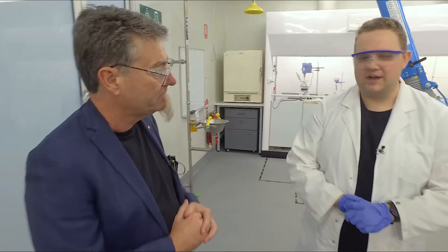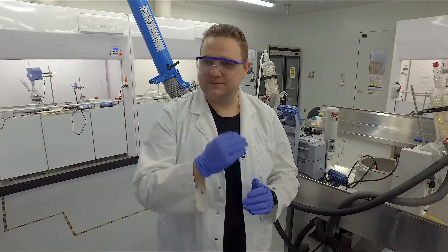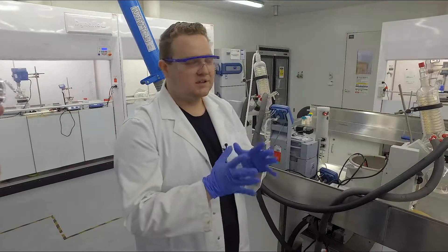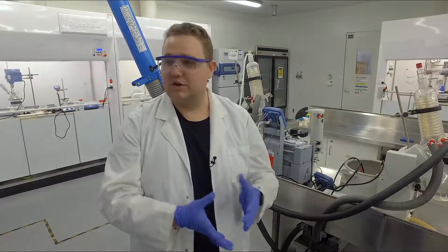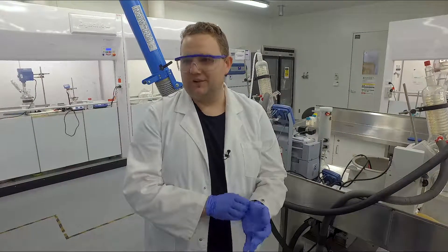Everything with upscaling becomes a lot different. Every parameter of these experiments and the results that we get out have to change. So what we have to do is really explore every single parameter piece by piece so that when we are making larger batches of these Bio-Inks, they'll be reliable and the same. There are a lot of challenges, but it's a slow working process.